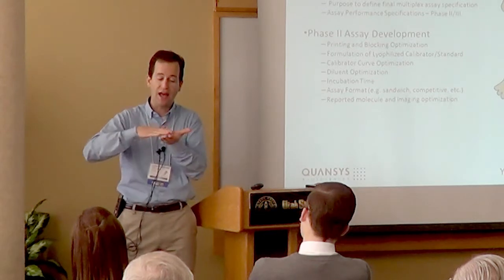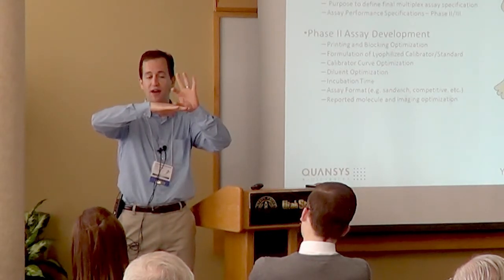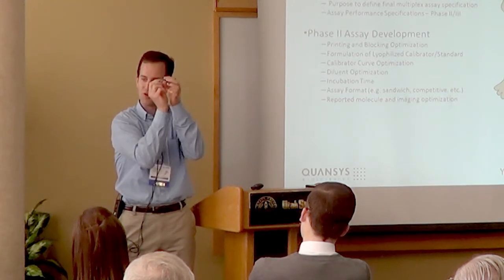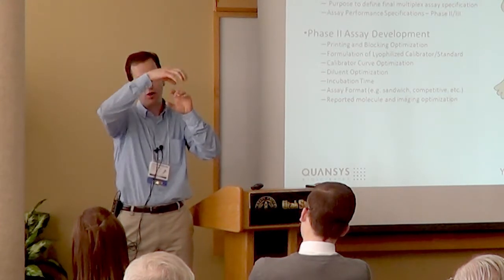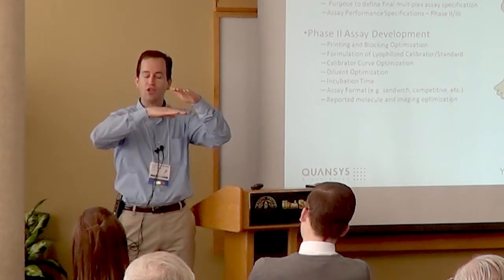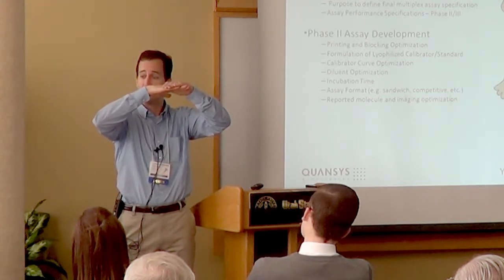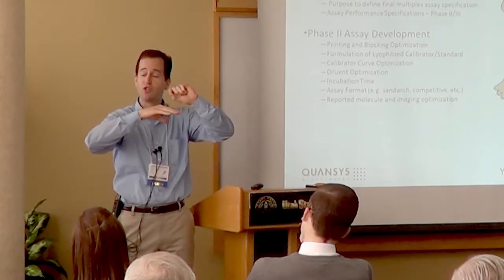So what they'll have is a shelf in there, you have your vial sitting in there lyophilizing, and then you have that rubber stopper. And if you look on the sides of those rubber stoppers, they have little ridges, and they're pre-populated in there. And then when you're done, the machine goes up and rams all those stoppers into the shelf above it and pushes all those stoppers down.